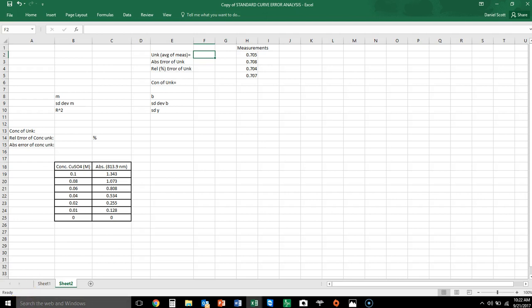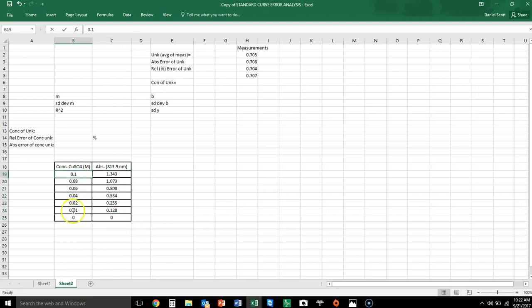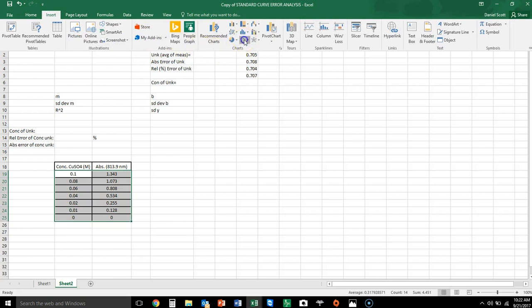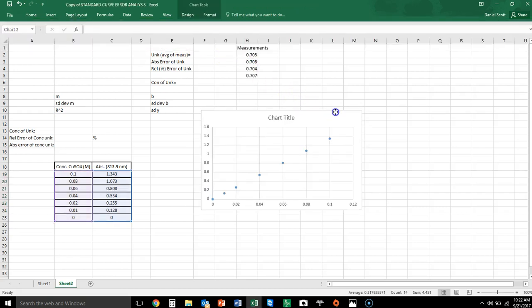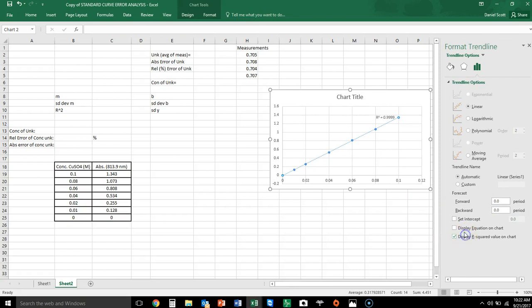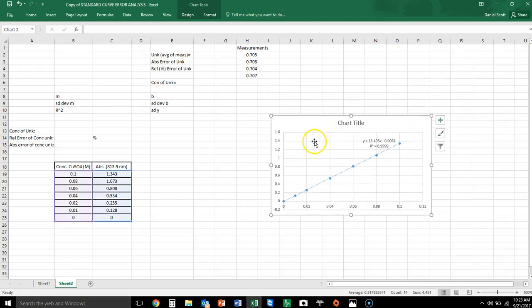For example, if I have concentrations of some chemical and I'm comparing the absorption values of those concentrations to make a standard curve that I could use spectrophotometrically to determine the concentration of an unknown. Here we have our standard curve — we add a trend line and include the R-squared and the equation on the trend line.